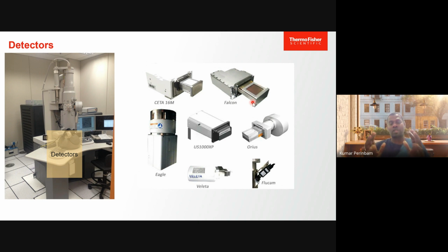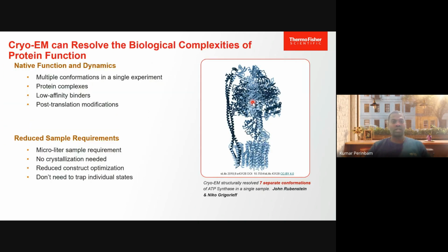But right now, the size of this Falcon camera is almost like a box of 1 foot by 1 foot. Hopefully someday in the future, once we have the development in quantum mechanics, maybe we will be able to fit that in our mobile phone as well.